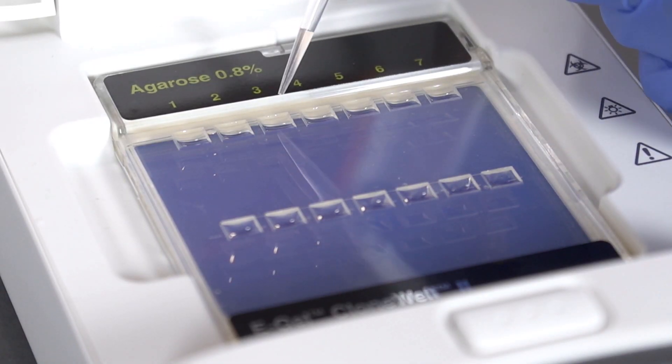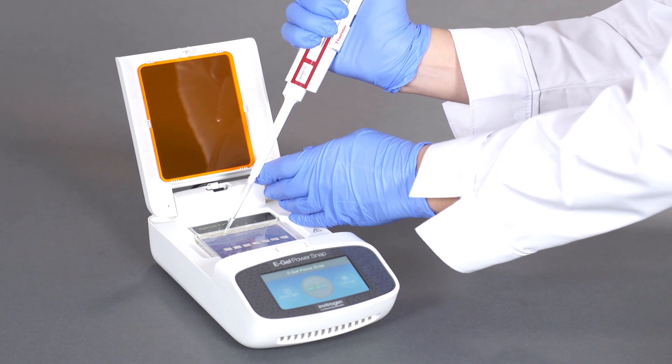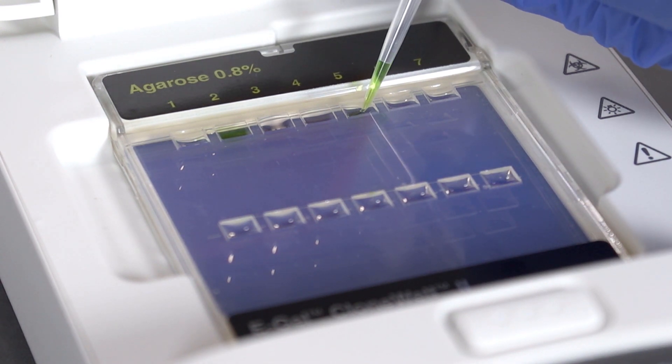Load 25 microliters of prepared sample bottom up into the pre-filled loading wells. Load 25 microliters of eGel 1 kilobase plus express DNA ladder, designed exclusively for eGel CloneWell gels.